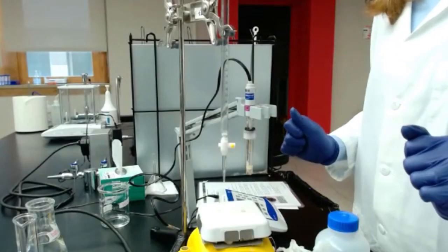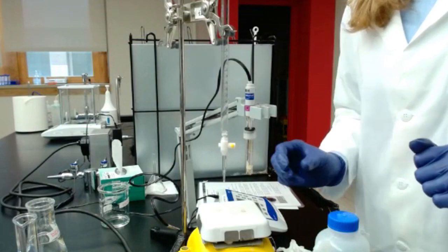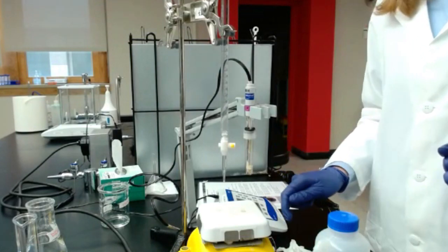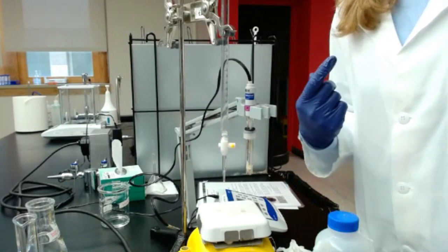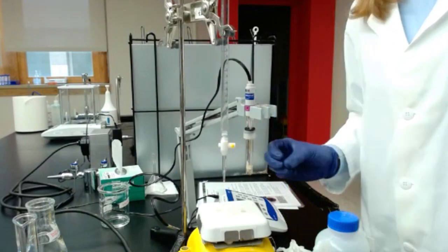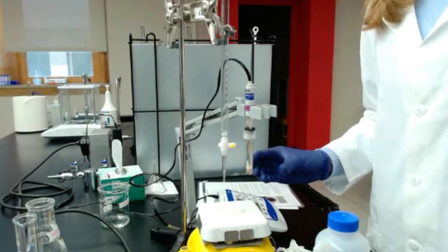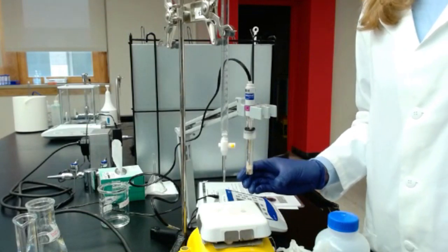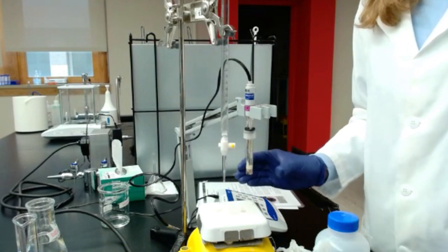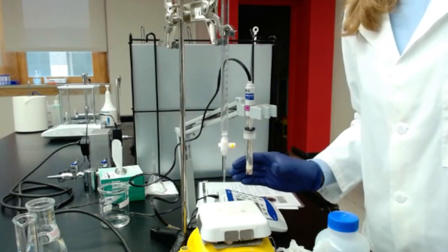Should you stir fast or slow? That's hard to define, but if you go too fast, you can bring in too much oxygen or air bubbles, which will change the value of the pH a little bit. So make sure you still stir in a way where everything is in contact with the probe, but without bringing in too many bubbles.